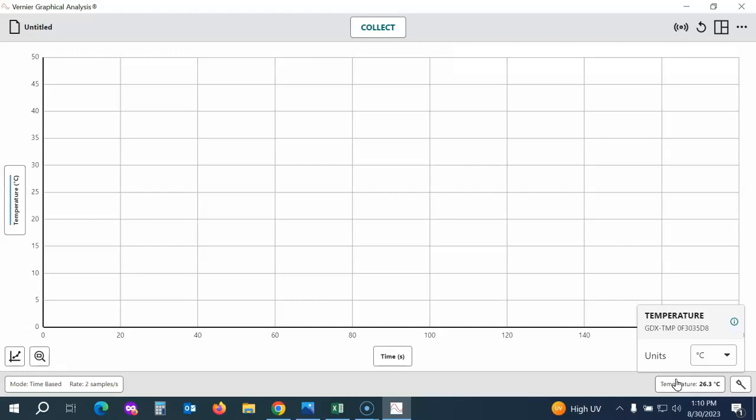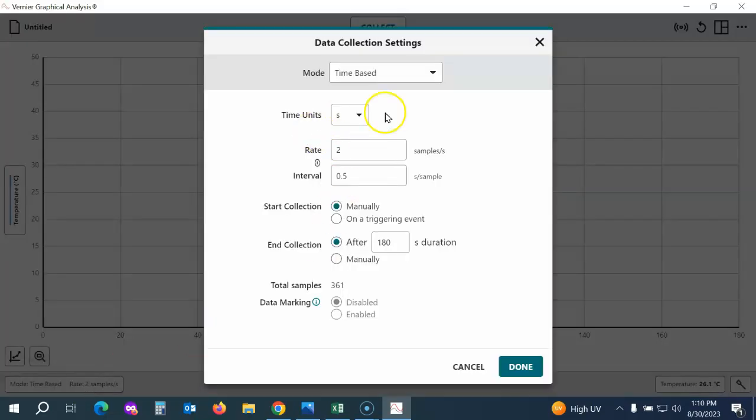The temperature probes do not require zeroing or calibration. Refer to the lab document to set your data collection settings — that's over here in the lower left corner. Most of our labs are time-based. You can change the units and set either the rate or the interval. You don't need to set both; as soon as you set one, the other will automatically update.